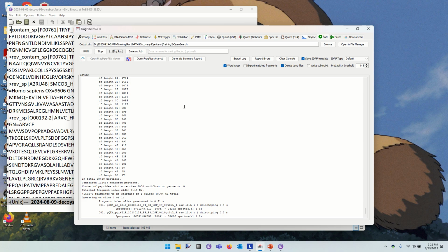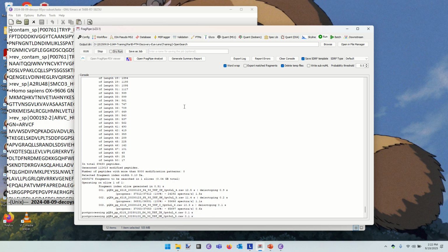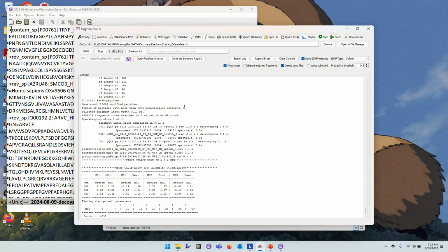How about the effect of precursor mass tolerance? If I allow for a 10 ppm peptide mass error, then I make far fewer comparisons than if I have a 2 Dalton window, right? I mean, that's 10 ppm versus 2 Daltons. It's a pinprick versus a massive space. So the more tightly precursor tolerance is set, the fewer the peptides you end up comparing to each spectrum.